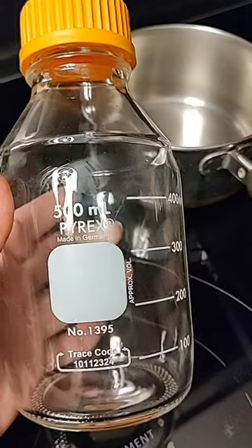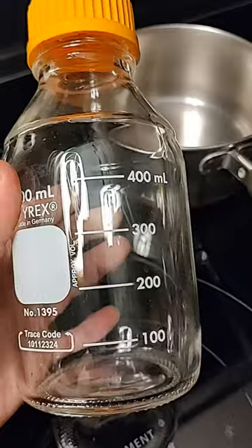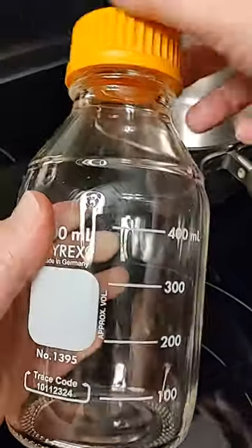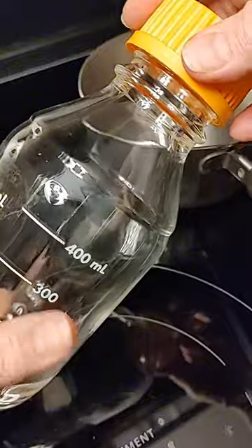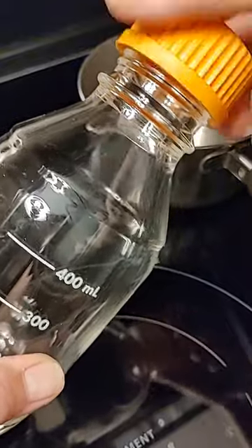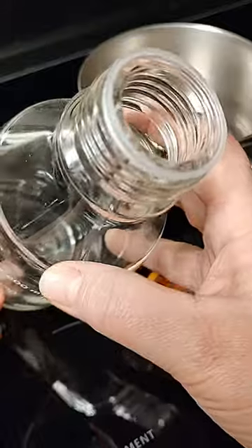How to make agar. It's actually super easy. We have so many full-length videos for you at Mycology Exploration, but we have a new one showing you how you can use these jars to create your agar.